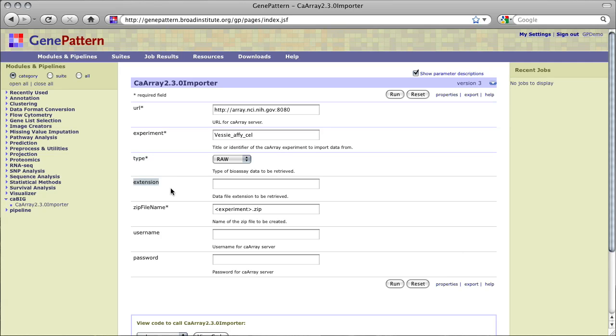Extension is an optional parameter which will specify the data file extension to be retrieved. If specified, only data files with this extension in the experiment will be imported into GenePattern. If this is not specified, all files of the specified type, raw or derived, will be retrieved.